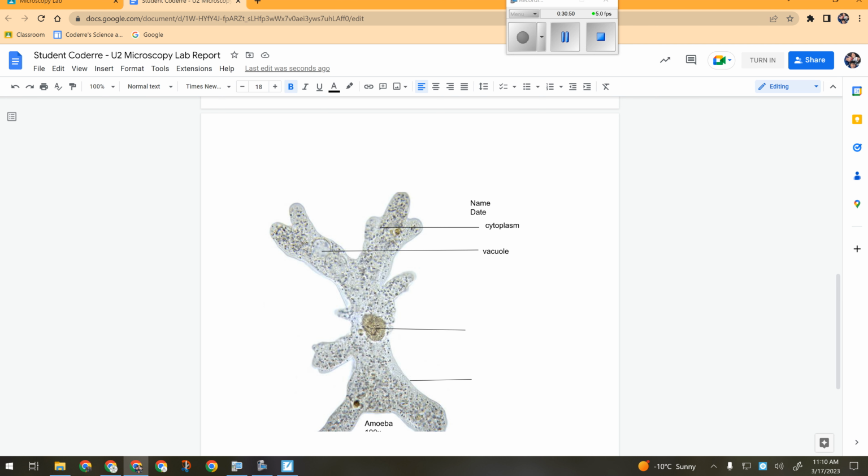So we're going to do those 4 things. You're going to take pictures with your phone. One member of each group can take the pictures and share them, or you can each try to take the pictures. We want to do this in partners. No bigger than that, because if it's bigger than that, then everybody doesn't get to use the microscope very much. I would like each person to be finding half of the stuff you look at. So find a partner and work with a partner for the lab, for the analysis part.